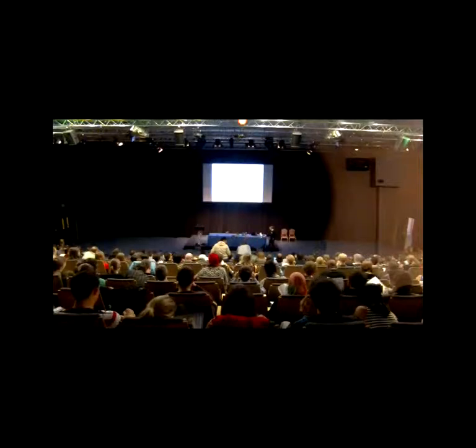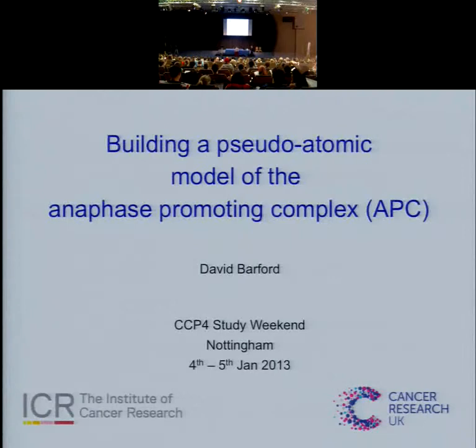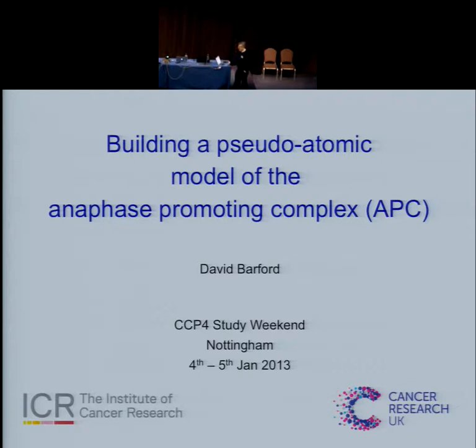Combining high-resolution information from crystal structures with the lower-resolution information from electron microscopy structures is known as a hybrid approach. We used this method to determine a pseudoatomic structure of the anaphase promoting complex, or APC, which is a large multi-protein complex. I'll say a little about the APC first, then describe our methodology for determining the pseudoatomic structure of the APC.